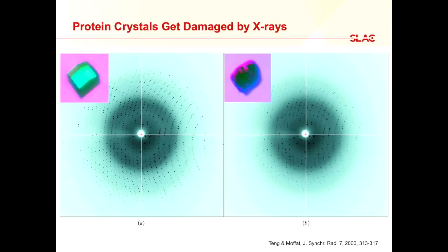And this is what such a measurement would look like. This is one angle. You have to rotate the one crystal at the start of the measurement, to measure all different angles, but this is what one such pattern would look like. But as I said earlier, those molecules of life are sensitive to X-rays. You cannot put them in an X-ray beam forever. They will eventually get damaged.